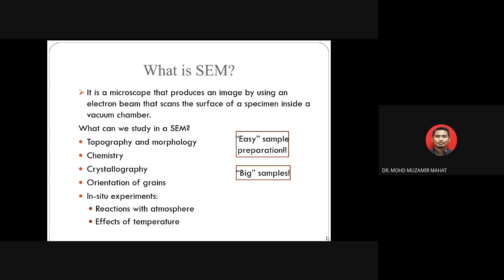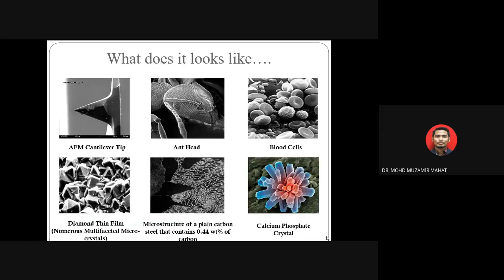One of the things that we can highlight here is that SEM is relatively easy for sample preparation. And interestingly, a big sample is one of the concerns. It is still relative how big a sample is, which is one of the considerations that you need to consider during the experiment.